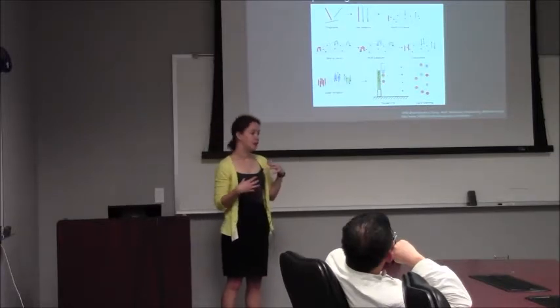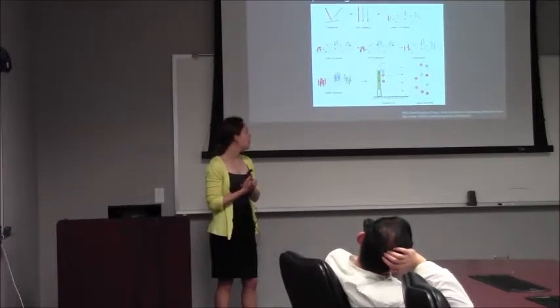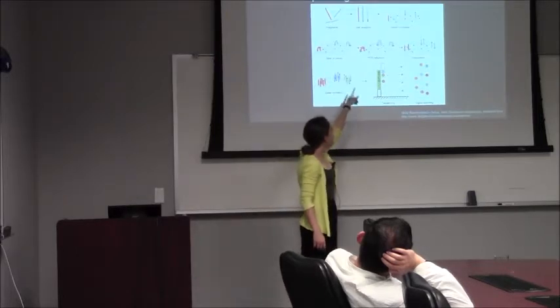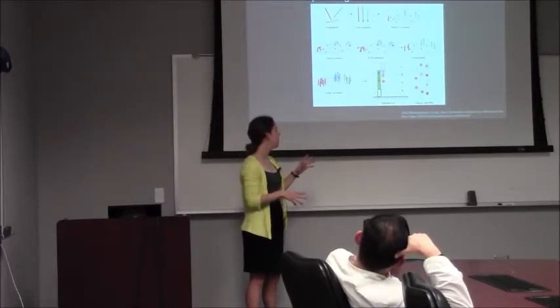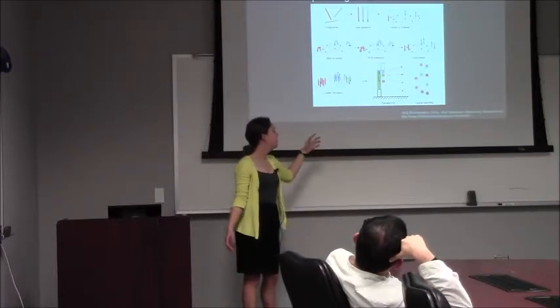And then you can start doing the sequencing procedure, which if you think about sequencing, you have one sequence here, and the A would have one corresponding base. So if you put the nucleotides over the mixture, the T would match with the A and such and such.